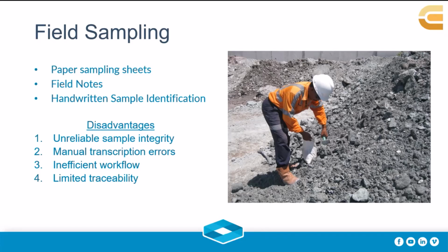Another downside to this approach is, when you're copying the field notes to an electronic system, there's a possibility of manual transcription error. There's one study that we found that showed an 8.8% rate of error when you're manually entering data. So that's over 8 results per 100 pieces of data that could actually be incorrect. And I'm sure this would be of concern to any company's quality process.